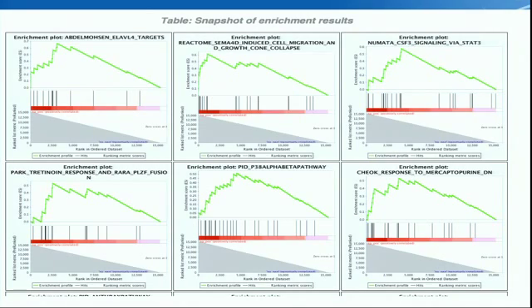So the idea is if you shoot up very quickly, then that means a lot of genes that are in this gene set were at the top of your hit list. Okay? So these are all ones where there is clearly an enrichment for genes in this gene set at the top of your hit list. So the value goes up and then starts to decay over time. Likewise, you can certainly have the case where a lot of hits are found on this side, where for whatever reason, that particular gene set was strongly depleted in your screen. So you can certainly see that too.